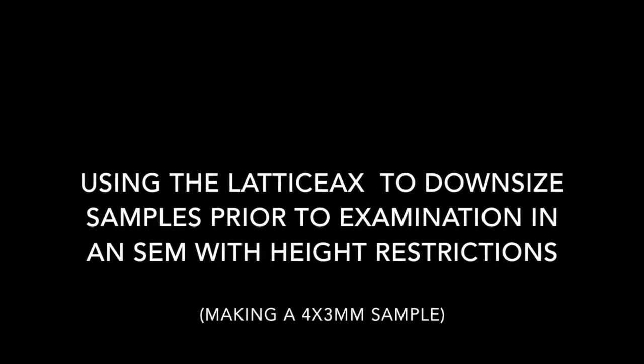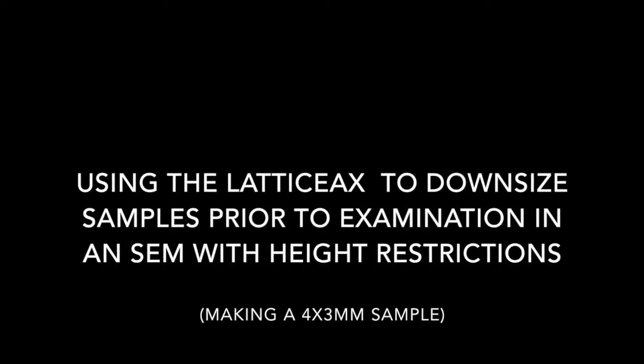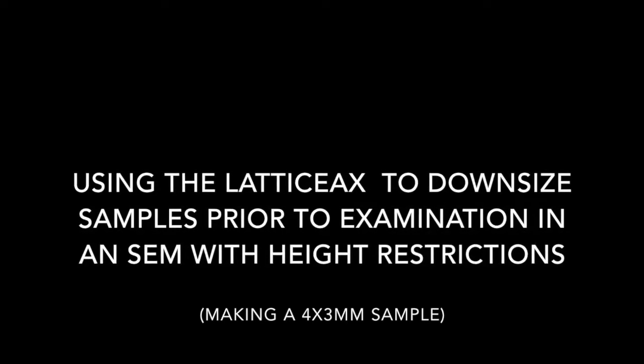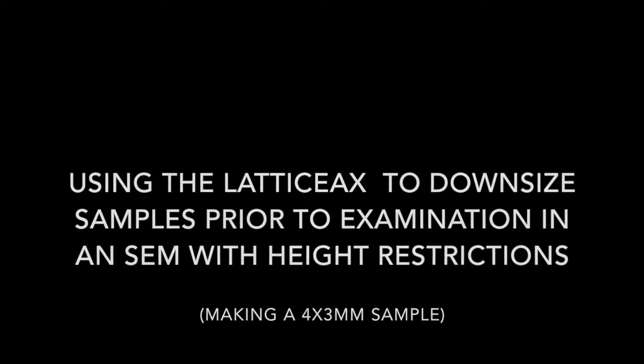In this video, we'll downsize a sample so that it'll fit into an SEM with height restrictions. In this case, we'll make a sample that's four millimeters long by three millimeters wide.